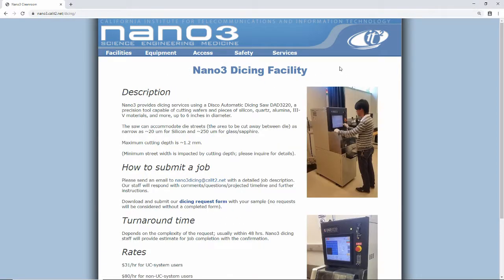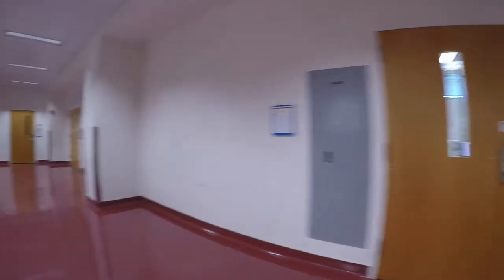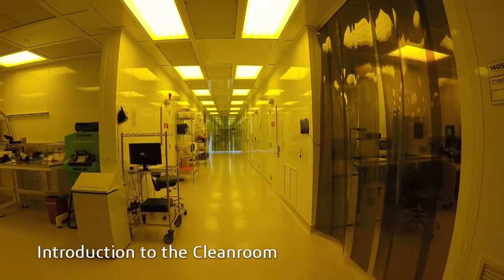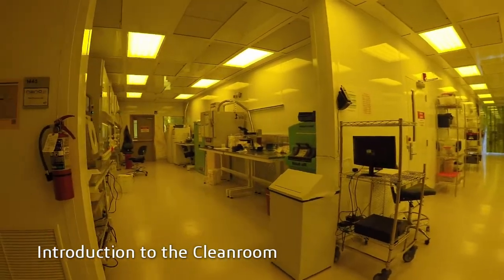This completes the analytical lab portion of this video. The rest of the video covers an introduction to the cleanroom. A cleanroom is a specially designed lab that keeps airborne particulates to a minimum. Cleanrooms are rated by class standards.